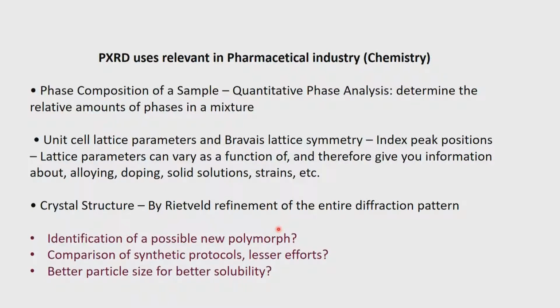So, what are the access points which we have got to do this kind of an analysis? Of course, we can always record a powder XRD of a given material. It is a very easy procedure now. It is not like we spend a lot of time to grow a single crystal and get the single crystal diffraction data. Powder is already formed in our experimental protocol.